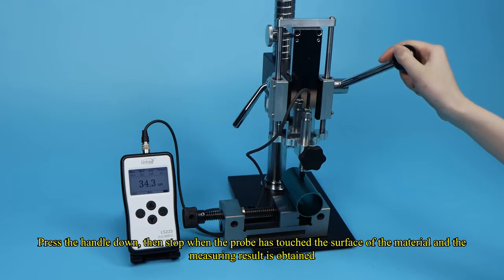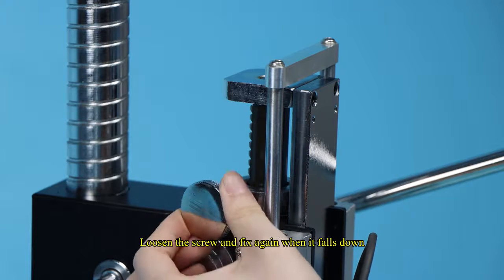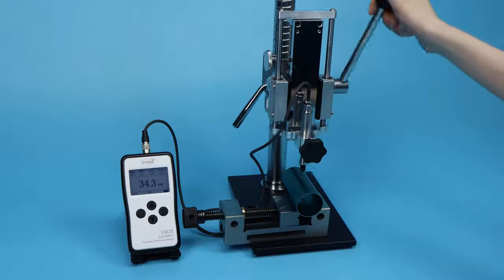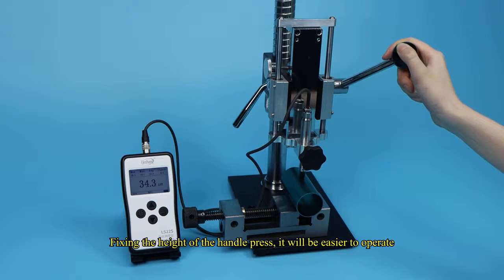Press the handle down, then stop when the probe has touched the surface of the material and the measurement result is obtained. Loosen the screw and fix again when it falls down. Fixing the height of the handle press makes it easier to operate.